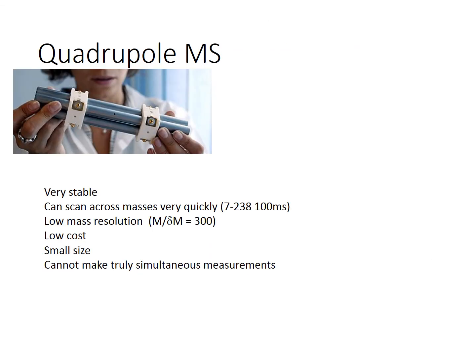So that's quite a big one. They're just four metal poles, and the ions make it down in the center.